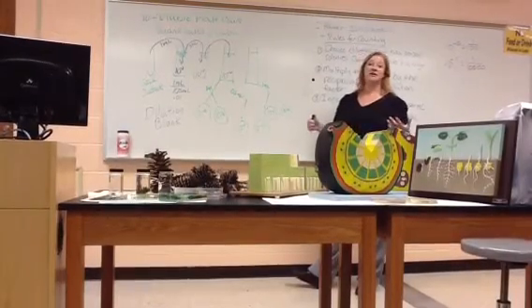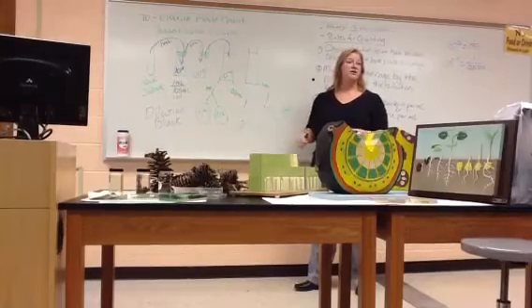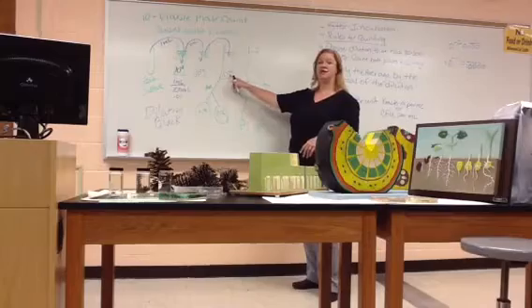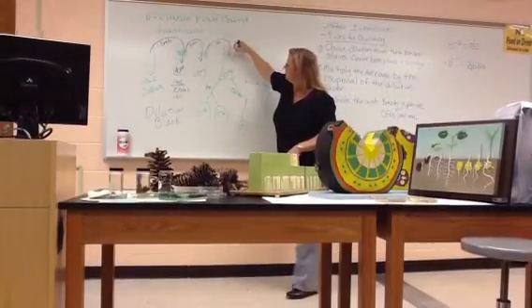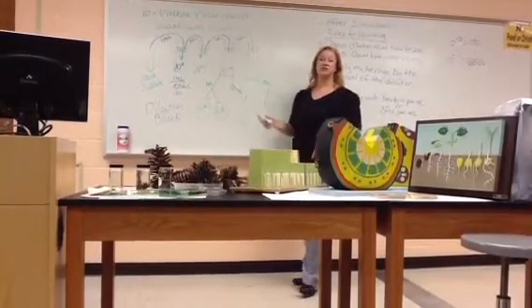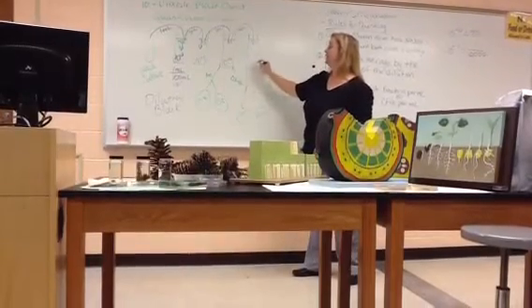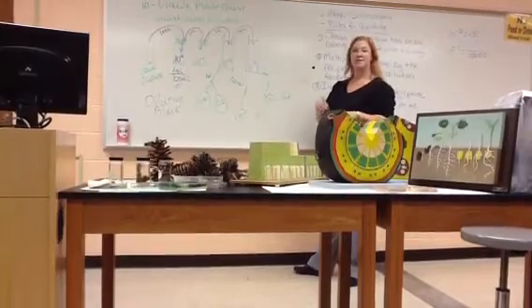And then again, we're guessing here. We're not sure where we're going to get the right amount of isolated colonies that we can see. So we're going to make 1 more dilution. We'll go back into the 10 to the minus 6 bottle. That was a ml of liquid there. Move 1 ml of liquid from the 10 to the minus 6 dilution into a new dilution blank. 10 to the minus 8. This is going to be our last one. Mix it up.